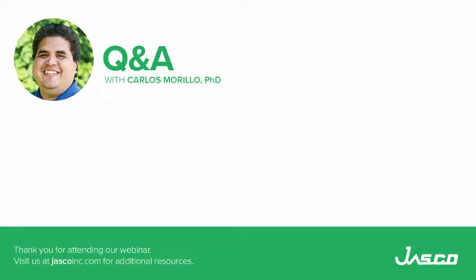Yeah, I can make a library of the compounds that I used today. We work with a third party, Bio-Rad software and also the Bio-Rad database. If you want, I can contact you and tell you which compounds I measured today. Yeah, you can use library scans for contaminant analysis. In Bio-Rad you can create your own databases if you have a common contaminant, or you can search there for what the contaminant is.